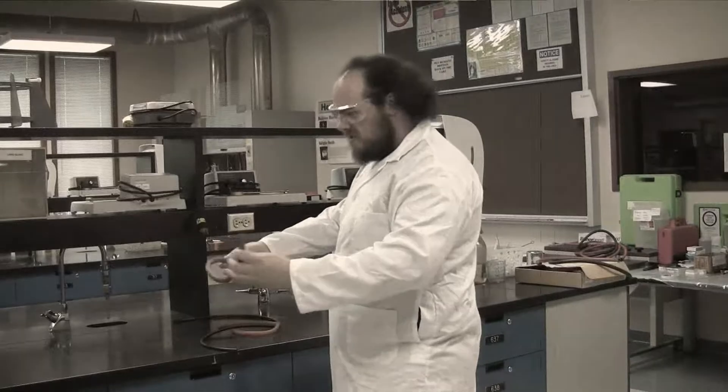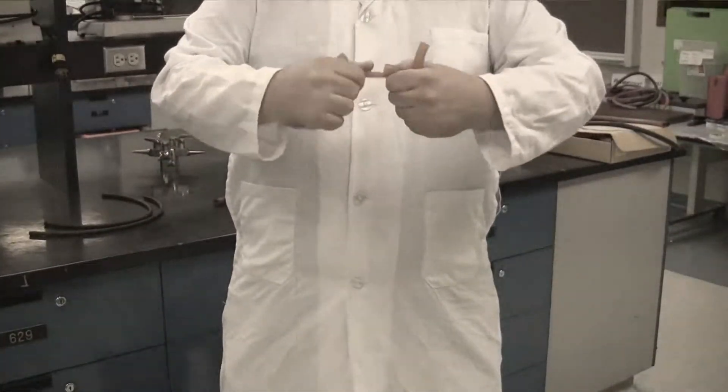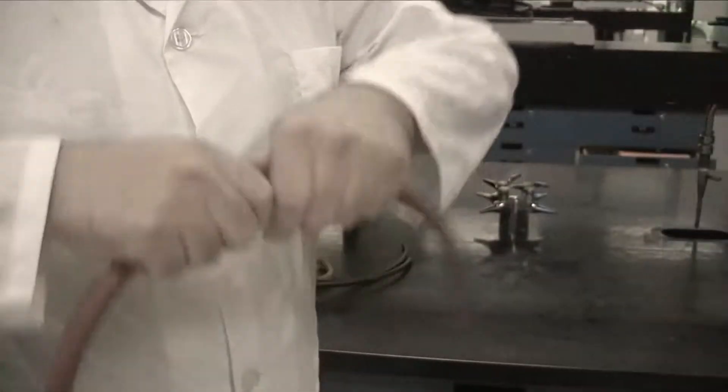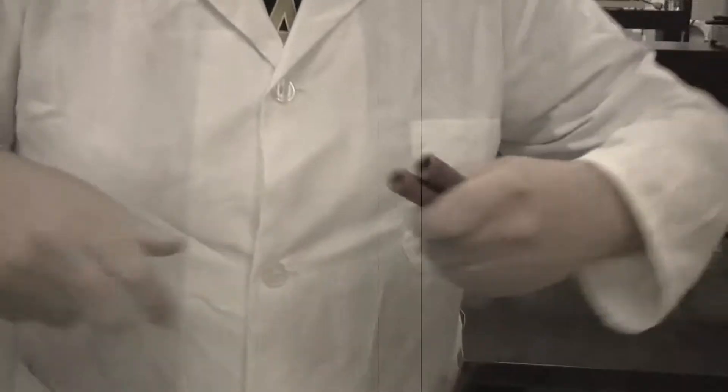Are you tired of never finding the right hose? Can't understand which is a gas hose and which is a water hose? They are too brittle and break in your hands, or some of them just snap and can't be controlled?